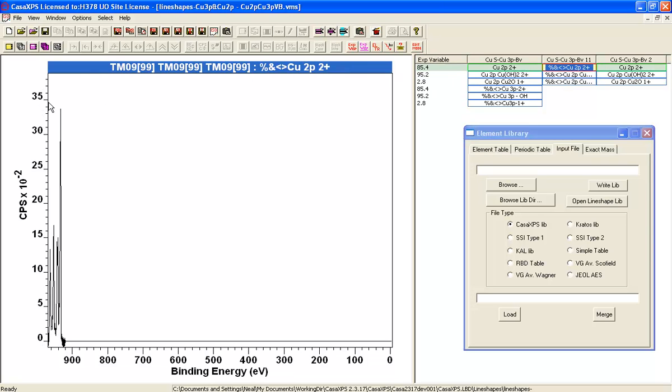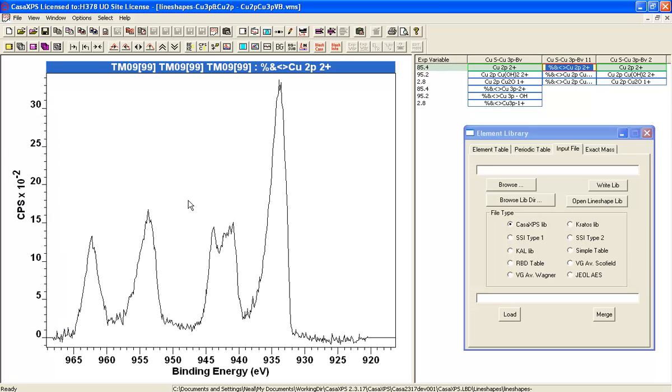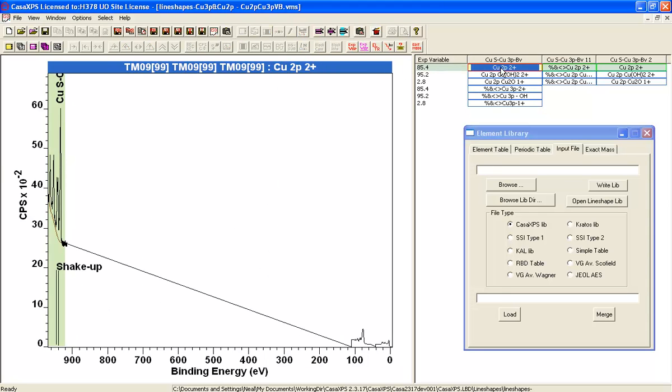So these are the line shapes. So if I wanted to zoom in, I can have a quick look at what that line shape looks like. And this has been derived, as I say, from data.